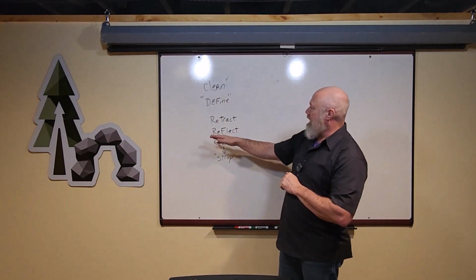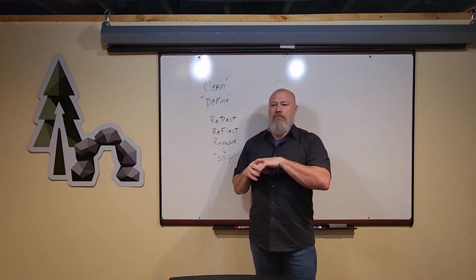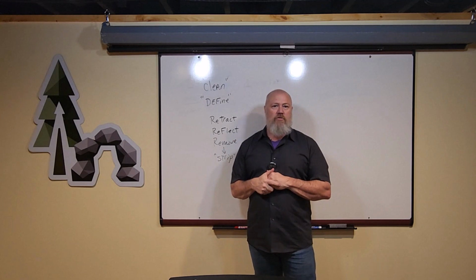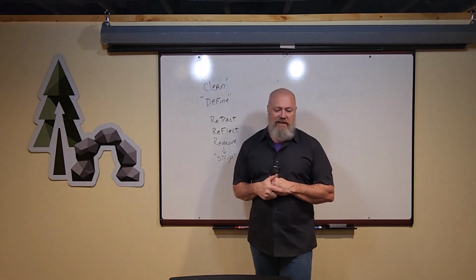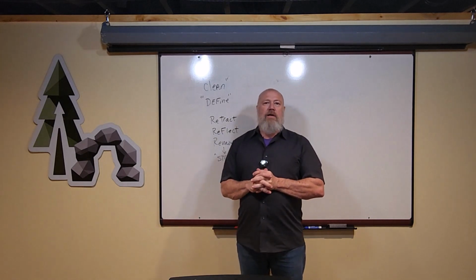And terms like reflect, retract, remove, strip, clean, define, these are all very specific terms, and you're going to need to read through your dissecting guide and be prepared for that in the lab, because I will use these terms when I'm giving the instructions, and we will go from there.